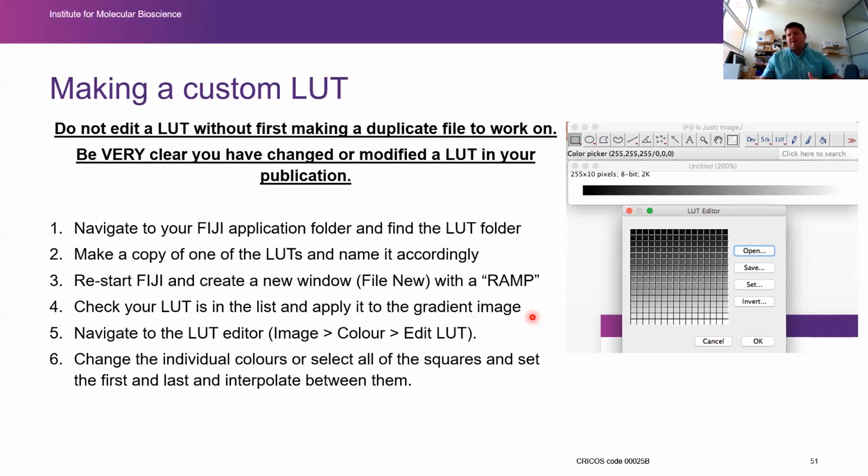It's just an Excel spreadsheet of numbers. There is this little editor as well, where you can click in numbers and define this one as black, and then you want blue starting at 50 and red starting at something else, and you can apply it. You can then get a window of that lookup table and show it. I've had a few people ask me over the years, which is why I've included it here.